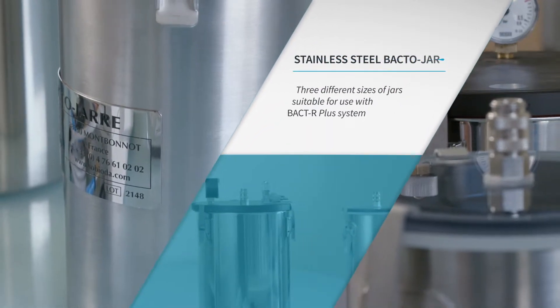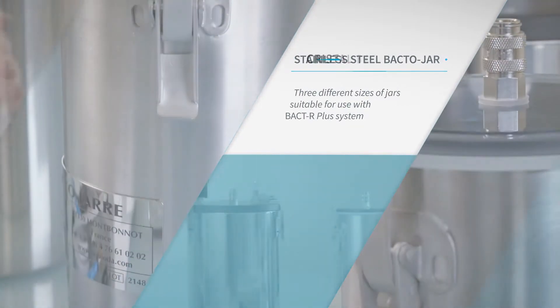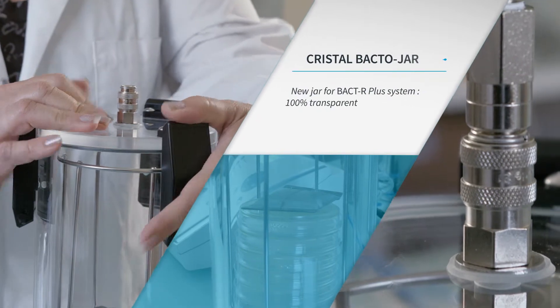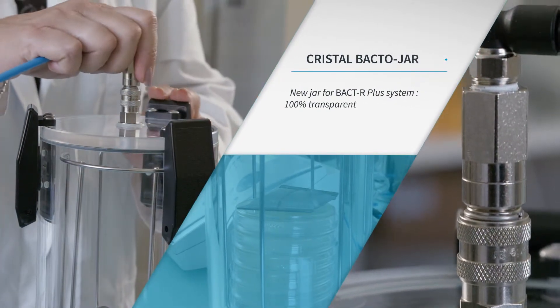Three different sizes for the stainless steel jars are available. Plexiglass jars are completely transparent and feature fast connectors to connect and disconnect the jar easily.